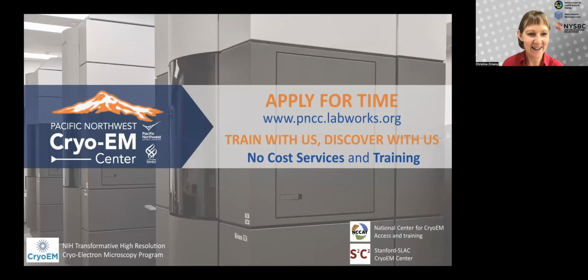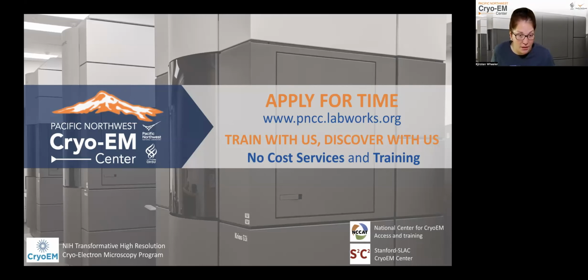Thank you, Ed. And Kirsten, what's up at PNCC? Let's see, currently at PNCC, we are actually having a Glacios 2 installed. So this will actually help with the 2 proposal types that we have, which is our screening access as well as our general access proposal.